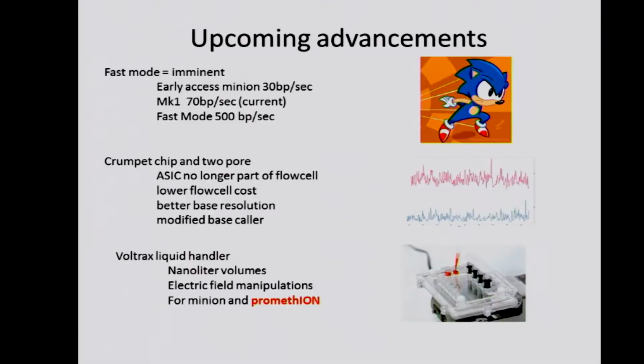They also have the Voltrax liquid handler. This is kind of a cool looking thing. I've only seen it once. It is a dedicated fluid handler for Oxford Nanopore. It's about the size of a pack of cards. It's got little wells in it.